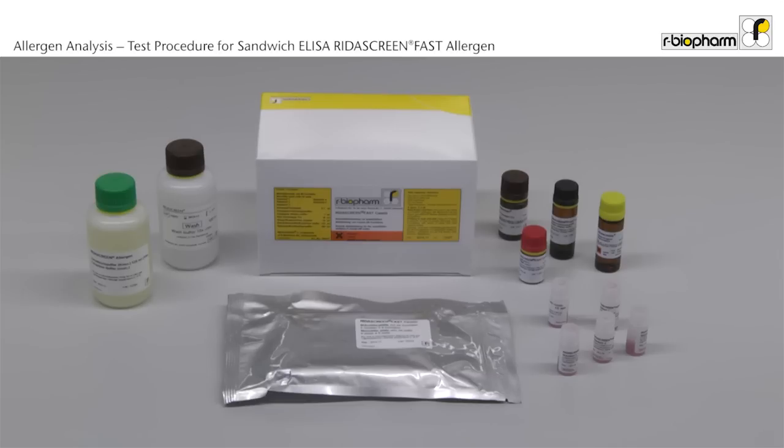RIDA Screen Fast test kits contain all reagents to carry out the test procedure. Unpack the bottles and the microplate from the box to bring all reagents to room temperature before use. This takes about 60 minutes.